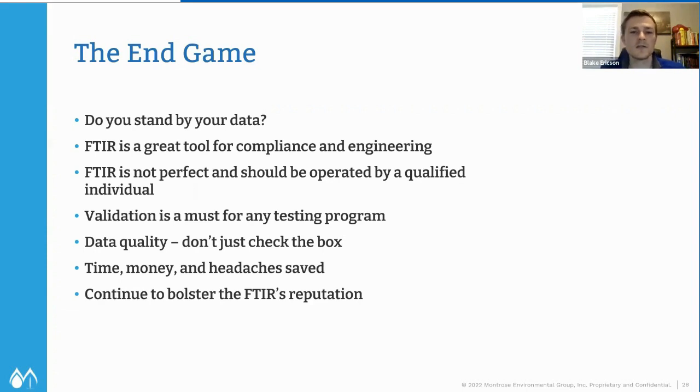So very powerful stuff. And it's not all sunshines and rainbows with the FTIR. It's not perfect. When it's used in the wrong pair of hands, it quite frankly is a scary instrument. And going back to my travels within this industry, I've done this internationally, and I've done it in most of the United States, and I've seen a lot over my short time of doing this. So just the lack of qualified individuals that run these things, it is fairly concerning.